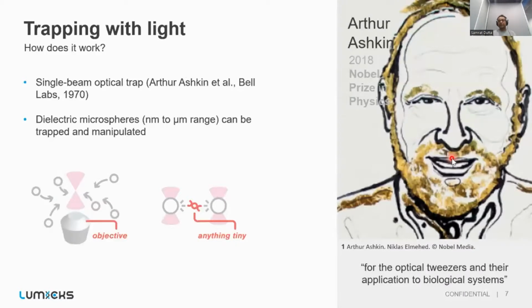And I want to quickly go over this. The C-trap integrates an optical tweezer with optical microscopy, and the optical tweezer in the C-trap is inspired by Arthur Ashkin, who invented it and got the Nobel Prize for optical tweezers in 2018.